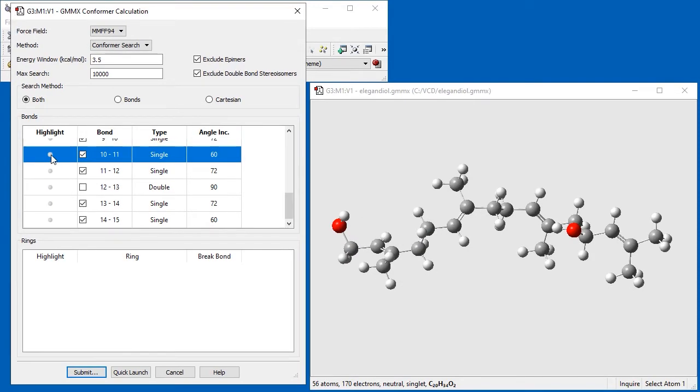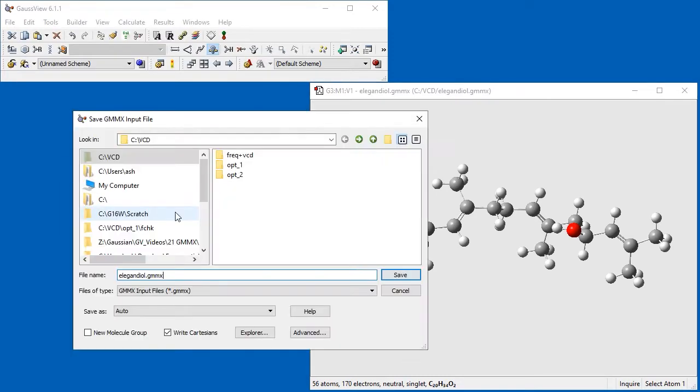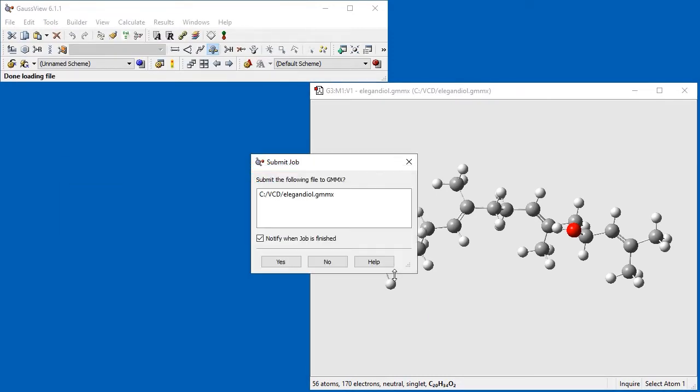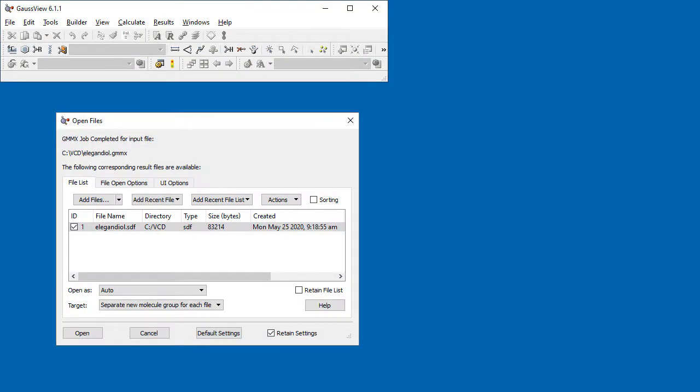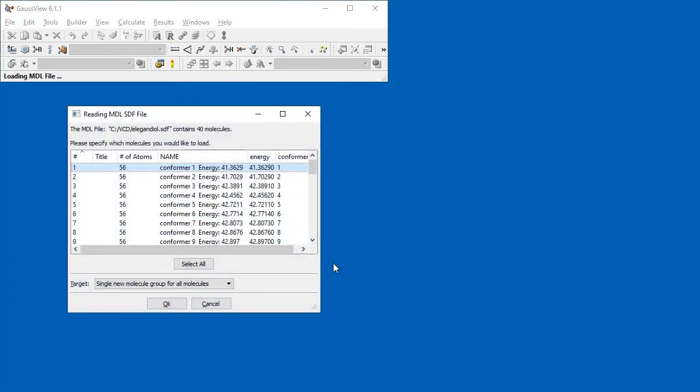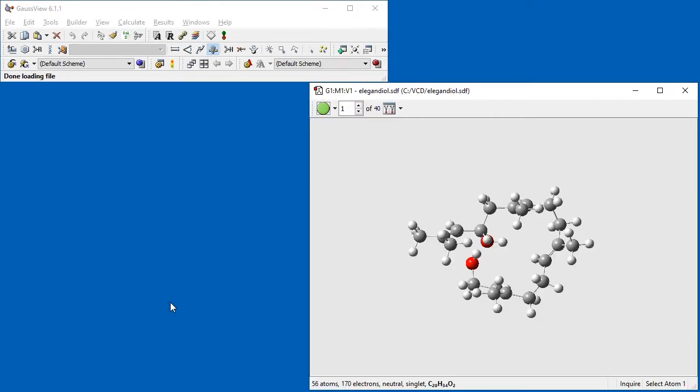After we click Submit, we are prompted to save a GMMX file and then start the job. When the GMMX calculation is finished, we are prompted to open its output file, which is an SDF file. When we do so, we see a window displaying the total number of conformations the program found - 40 in this case. We click Select All to select all 40 conformations, and we open them into a single molecule group.